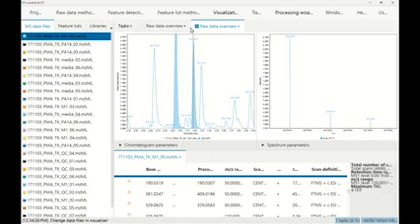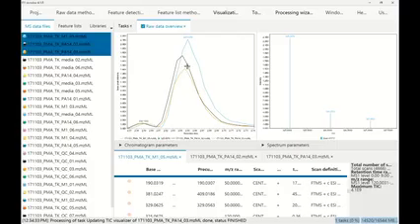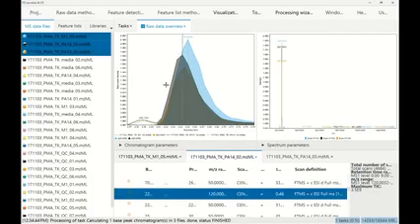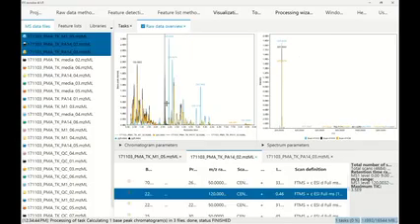Another thing that you can do is, if you see this check mark here on the top with the raw data overview, you can always select multiple samples, and then you can compare them in one view. You're going to see all the extracted base peak chromatograms here. I can click anywhere and then see the spectrum of all the 3 samples just overlaid. And maybe there's a little bit of a difference in the m/z. This is, of course, just a way to review your data.